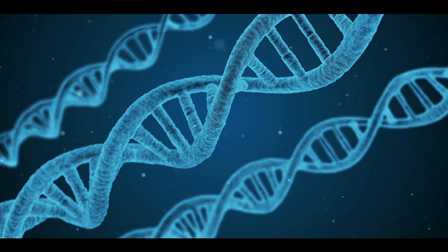Yeah, and even if you do everything right, you can add everything perfectly and still not get amplification. Sometimes there are inhibitors in your sample. Sometimes your primers need to be at a higher or lower temperature in order to anneal. PCR can be pretty tricky. Even if you've got really great DNA and you've done everything right, it can still fail.